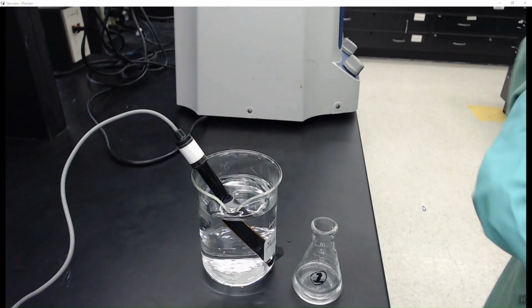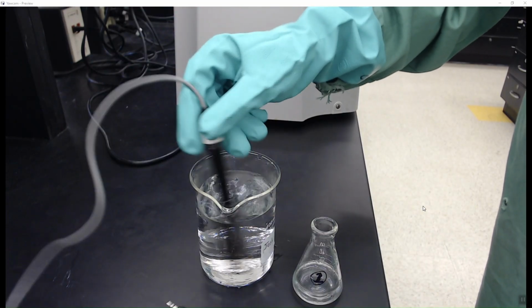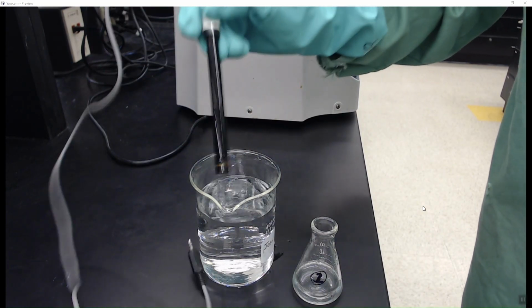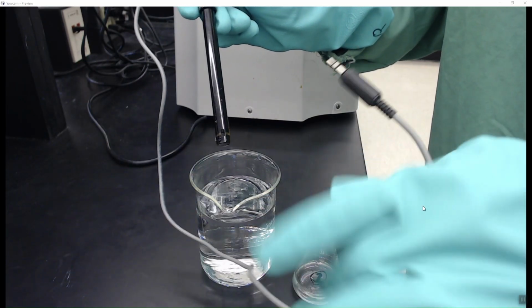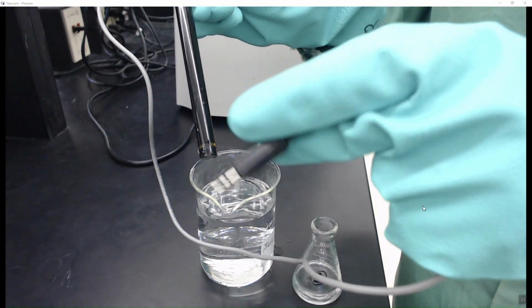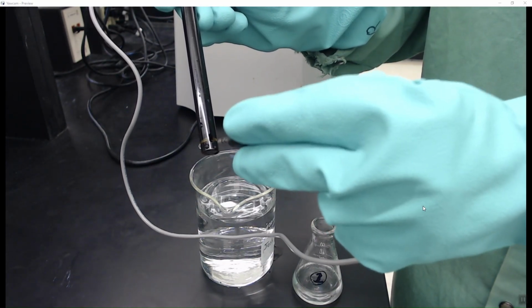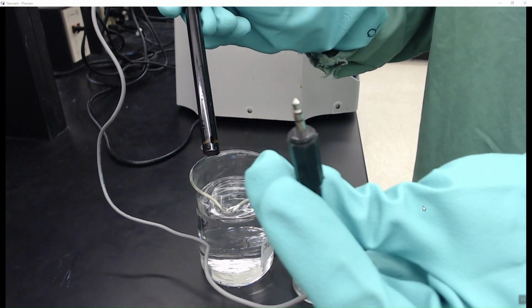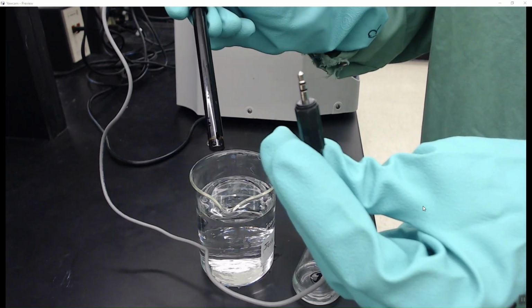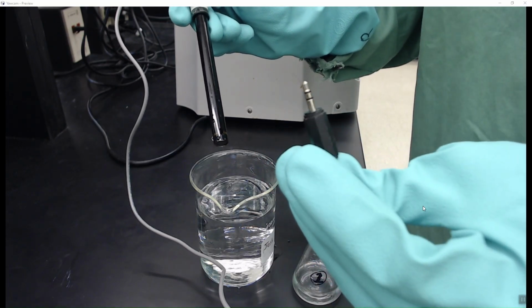Alright, so here we are in the lab, and what I have here is a large beaker of water. We're going to use this to rinse our conductivity probe. This is a conductivity probe right here, and I don't know if you can really see it, but there's a hole where the solution gets in and it analyzes it, so you need to make sure your solution is above that. It also has an old headphone jack, so make sure that you have the right conductivity probe. You don't have a thermistor, which has an Ethernet cable jack, so that's basically that.